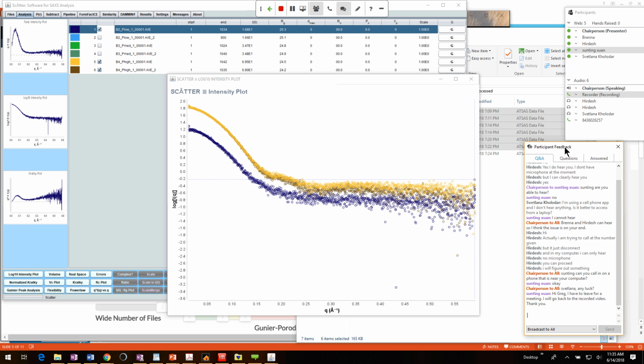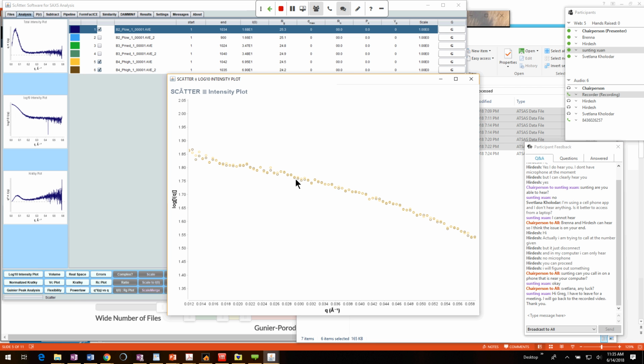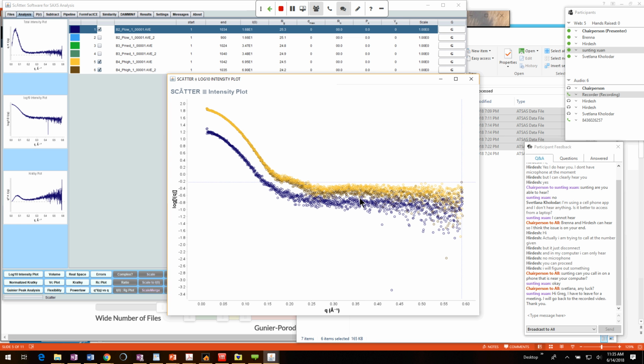Really, the error bar is the deviation between the points, right? So if I zoom into this sort of noise that you're seeing on the screen, that's really the error bar. So when you plot your data with error bars, it should be on that scale. Any other questions?